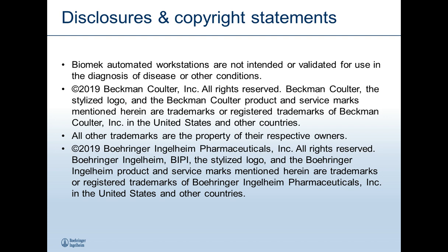How do you minimize edge effect in your automated ELISA? Well, there's several ways that you can go about minimizing edge effects. The easiest way to look at that is making sure that your plates are lidded during their incubation times. I would keep incubation times themselves as short as possible while ensuring maximum performance within your assay.